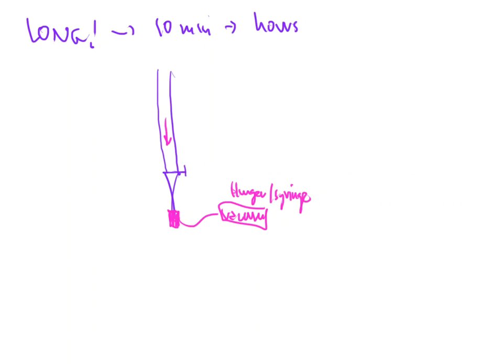All right? So let's talk about what this unknown territory, I'm not going to call it uncharted, but pretty dingy, pretty foggy environment, is going to hold for us. Okay? So what we've discussed up to this point has been handmade columns, and you use your eyeballs to look at the separation that takes place.